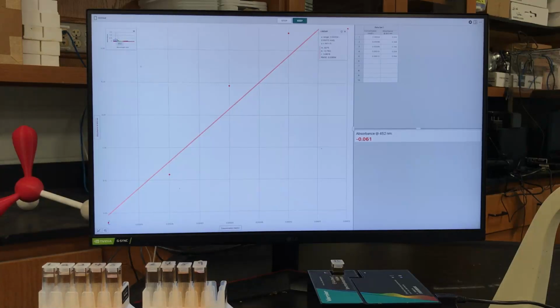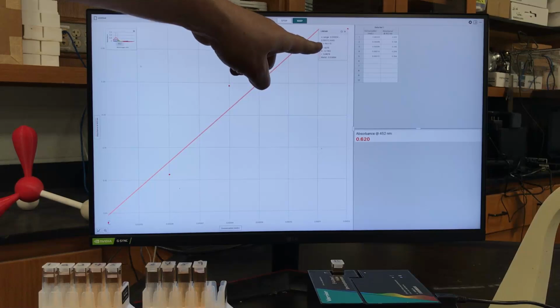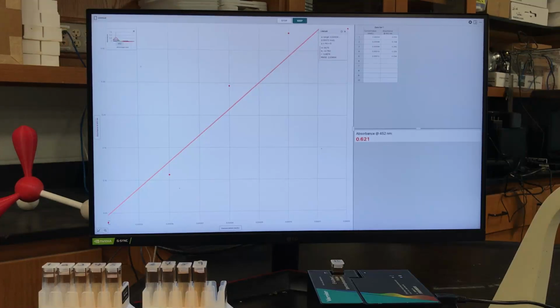All right. And that's going to have the greatest molarity of my product, which is the colored iron thiocyanate complex ion. So there were my 5 test solutions, and we're going to use those values to actually solve, knowing that the y is the absorbance, and knowing that my x is the concentration that I want to solve for, and knowing that I have y equals mx plus b, and this is giving me the slope and the y-intercept, I can actually solve for that. All right.